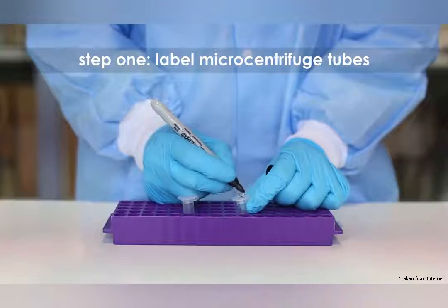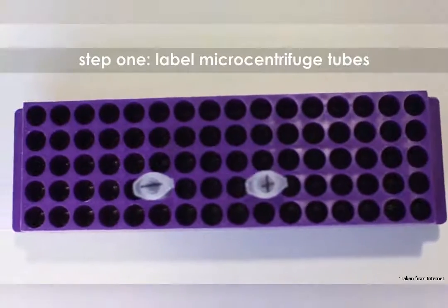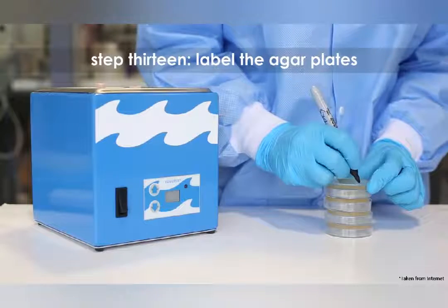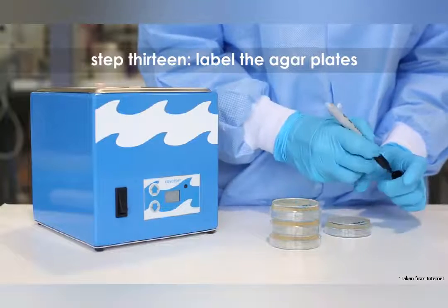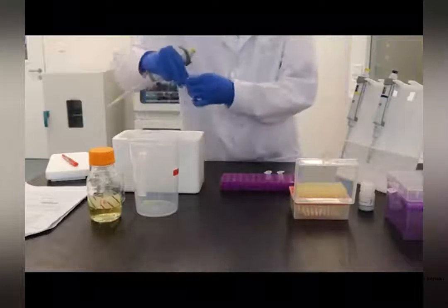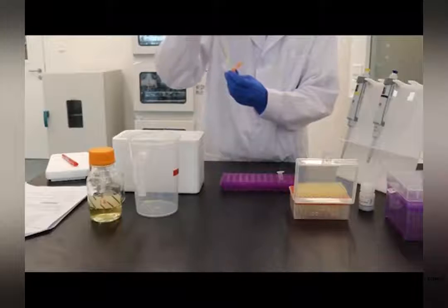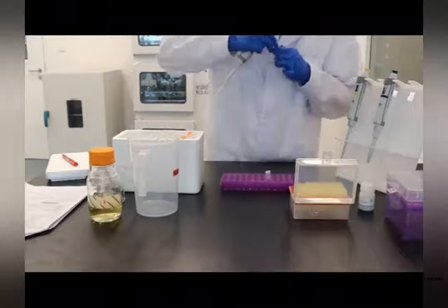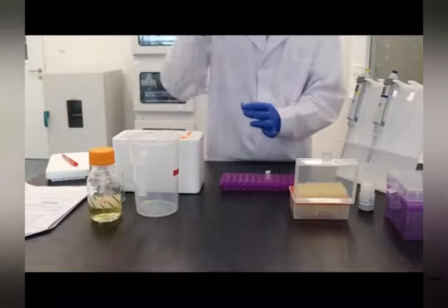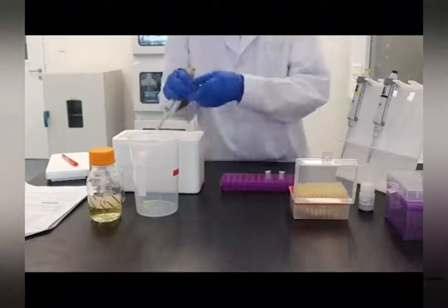Let's start our experiment. Label one microcentrifuge tube plus DNA and a second microcentrifuge tube minus DNA. Label four agar plates which contain different elements as the picture shows. Transfer 50 microliters of competent cells to each of the tubes. Add 10 microliters of the PUC plasmid solution to the tube labeled with a plus sign. Do not add the PUC plasmid to the tube labeled with a minus sign. Incubate both tubes on ice for 20 minutes.